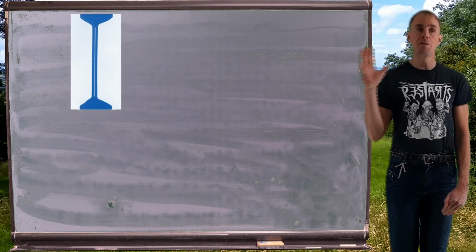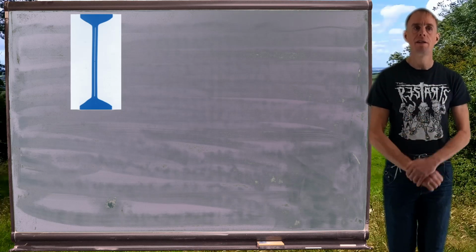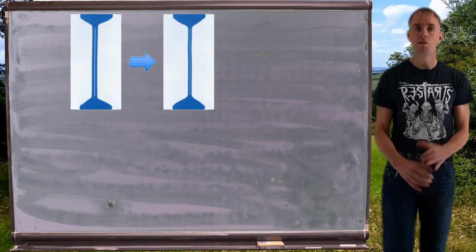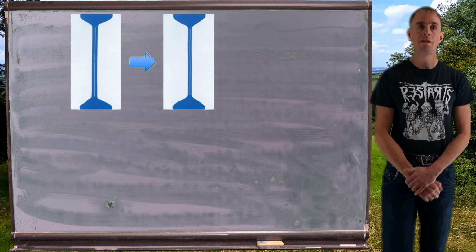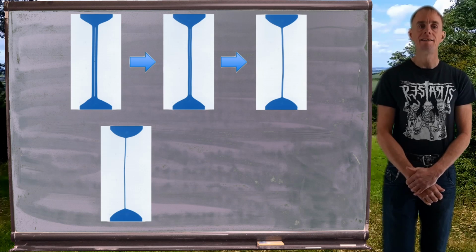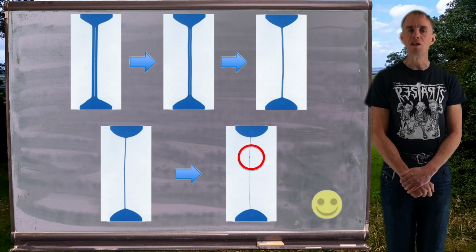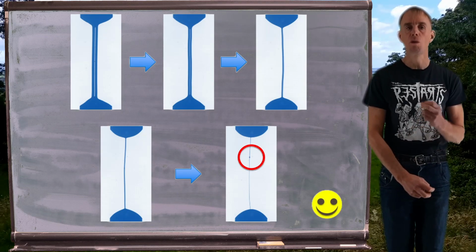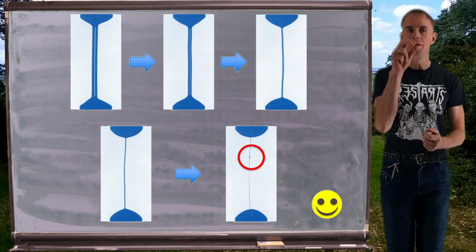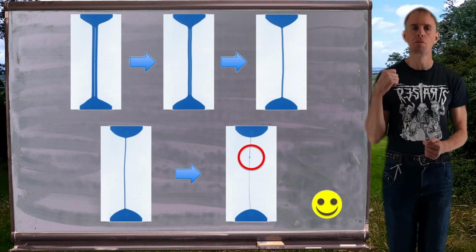Firstly, the fluid filament forms. The pistons are fully retracted top and bottom, and we have a beautifully cylindrical filament of fluid, which then narrows over time. The filament diameter becomes less and less until it almost subsequently breaks. The highlight on this final image is to show you a phenomenon called beads on a string. Here you can see that there's a tiny little blob of fluid suspended in the middle of this filament. This is very, very mild beading.